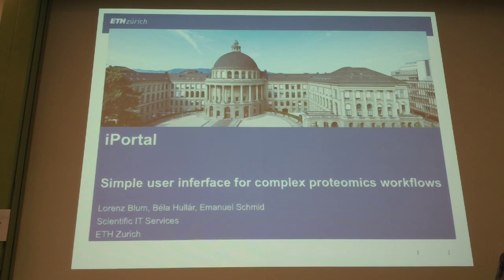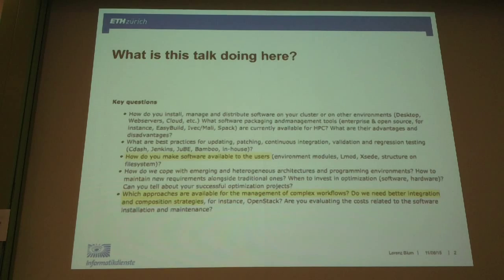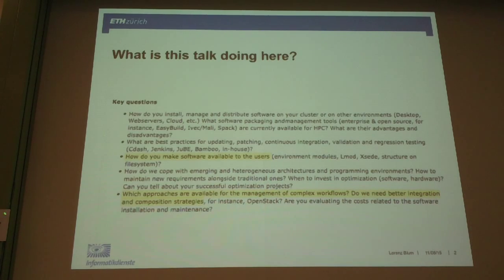Good. My talk will be about iPortal. It's a simple user interface for complex proteomics workflow. Now, many of you will have thought in the beginning, what is this talk going to be about? So I'm not talking about how we install, manage, and distribute software among clusters, but rather about this last point of these key questions: which approaches are available for management of complex workflows, and how do you make software available for the users?